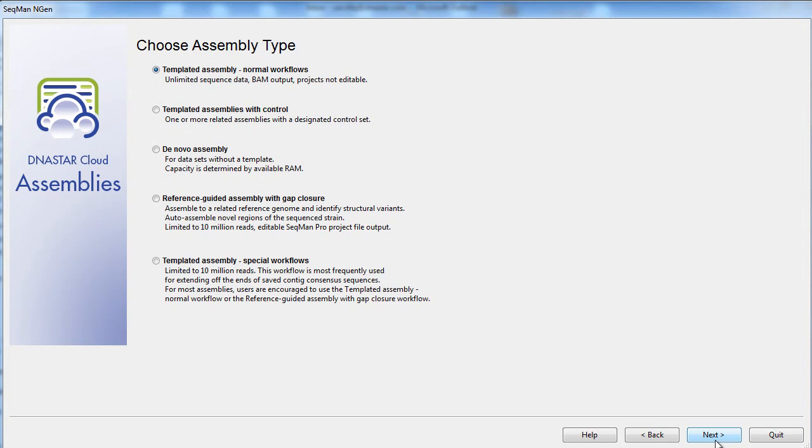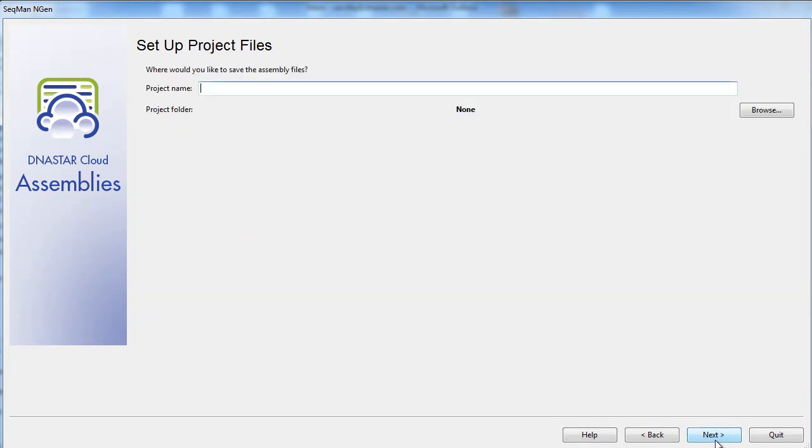Similarly, you will next choose the assembly type for your project. Next, we'll name our project and create a folder in the data drive to store our files.